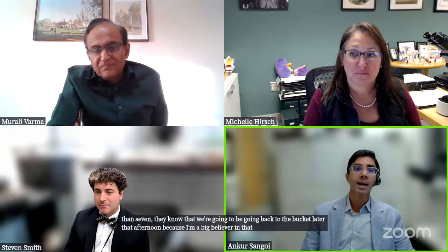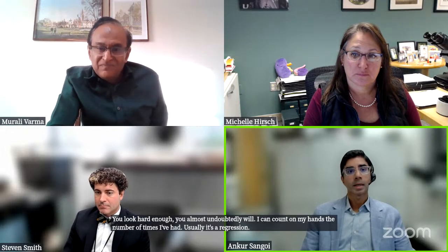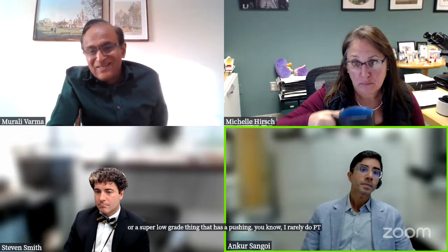If you go back, in enough greater than 7 centimeters, that cutoff is key. You will find it. You look hard enough, you almost undoubtedly will. I can count on my hands the number of times I've had it. Usually it's a regression or a super low grade thing that has a pushing border. I rarely do PT2B. The interesting one is, now let me be a devil's advocate and go the other way around.